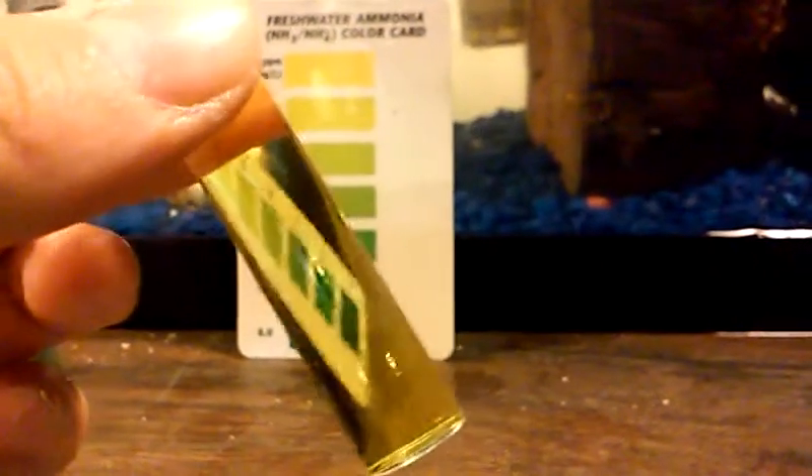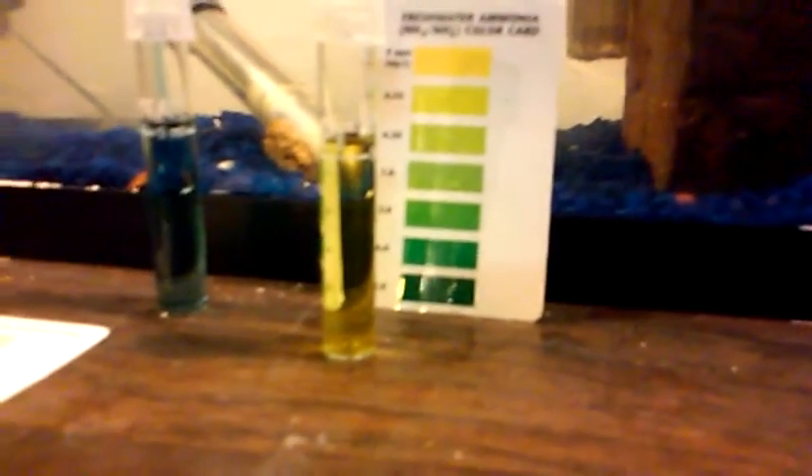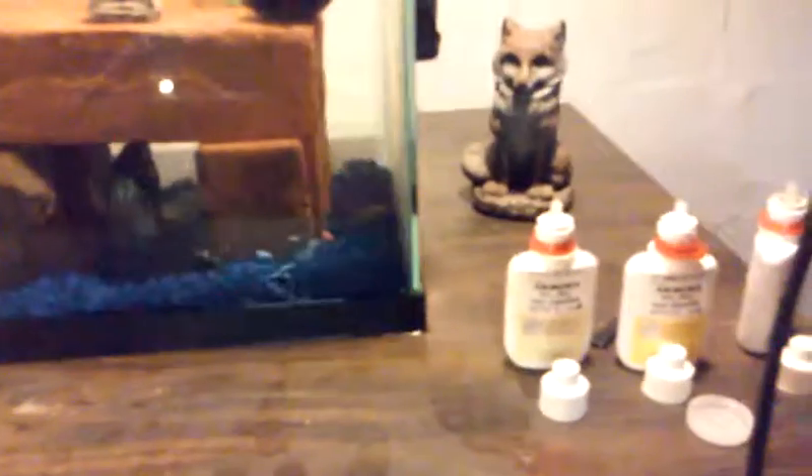I don't have that test right now - I will show how to test for nitrate in another video. Just make sure you don't get the drops in the aquarium because it is poisonous and it will harm or kill your fish. After you test, rinse out your test tubes in a sink completely - never rinse it out in the tank with the poison inside. That is how to test your aquarium water for ammonia and pH.